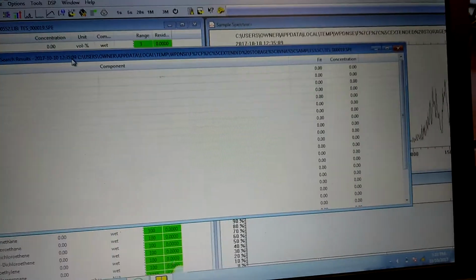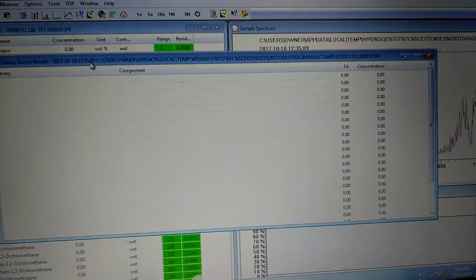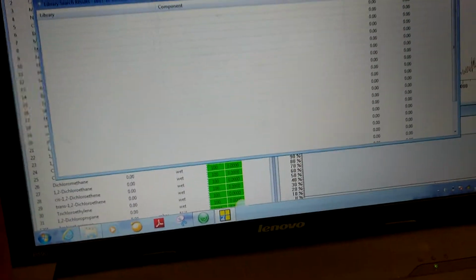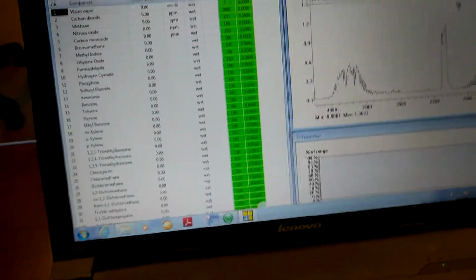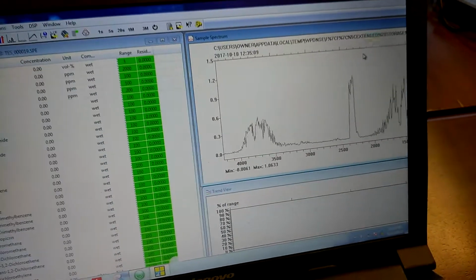This doesn't seem to do what I hoped it would do, but I've been told that you really should have a couple ppm of something that's not programmed in order to see it. It may be that I just have nothing. So that's supposed to be the process for that, but I'm not really sure how that works yet, so that's a gap.